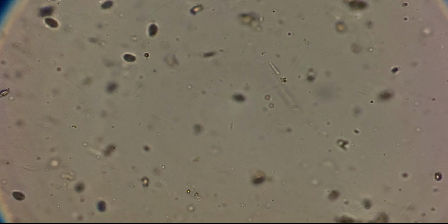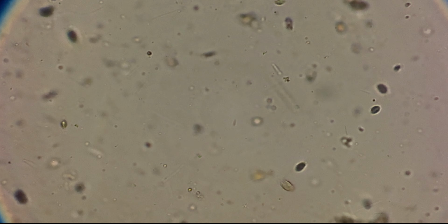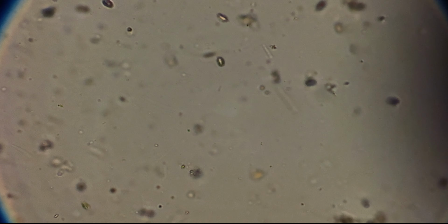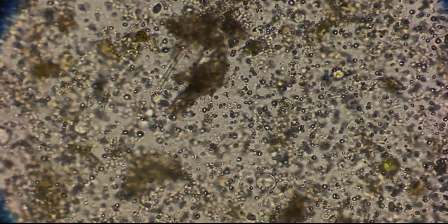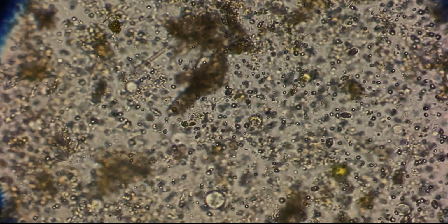Kiwi juice is naturally acidic. It also contains a special enzyme called actinidin. You've probably tasted its effect before, even if you didn't know it. It's the same enzyme that makes kiwi great at tenderizing meat. So what happens when that acidic, enzyme-loaded juice meets a slide full of living microorganisms?